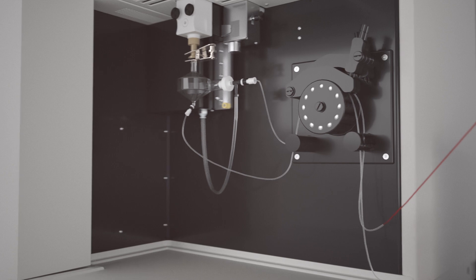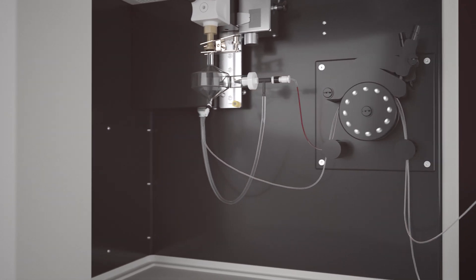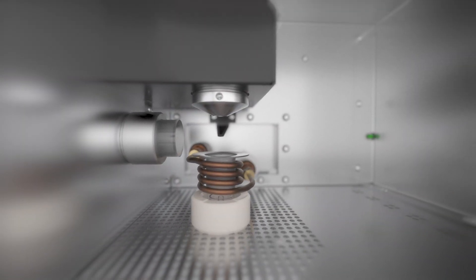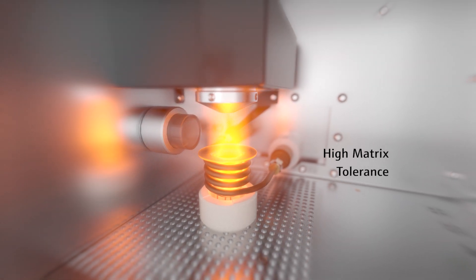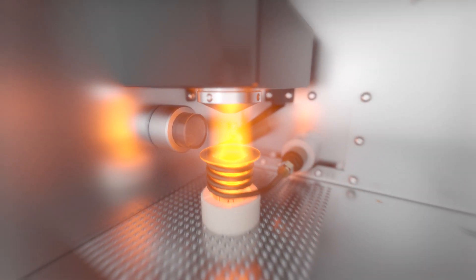A short-distance flow concept ensures highly efficient sample transportation and ideal positioning of advanced accessories. Ideal plasma conditions provide maximum sensitivity and robustness for any sample type.